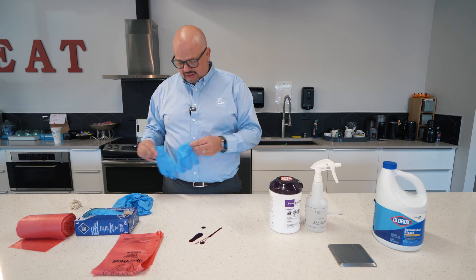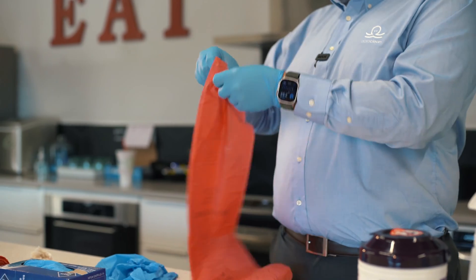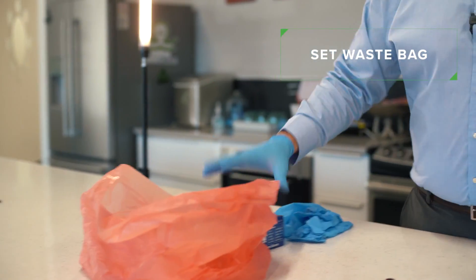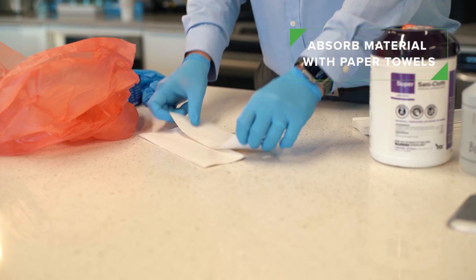What am I going to need to clean this up? Common sense says the first thing is to put my gloves on. I open up my biohazardous waste bag and position it so you don't need to reach in and out very often. Before applying any disinfectant, I want to do what I can to soak this up first.